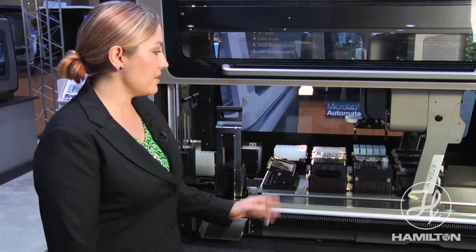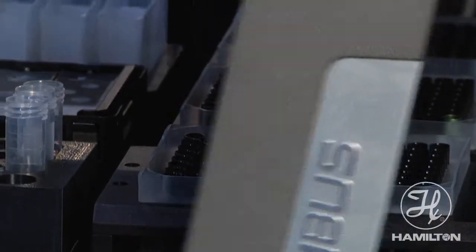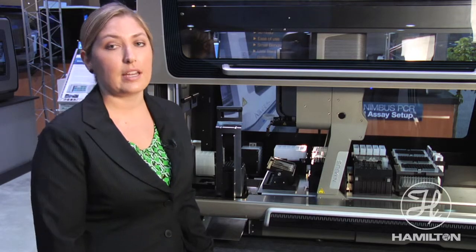This is a highly flexible system. We can do up to four automated slide tilt wash modules if the customer chooses to use those. However, it is not a requirement for some immunostaining protocols.